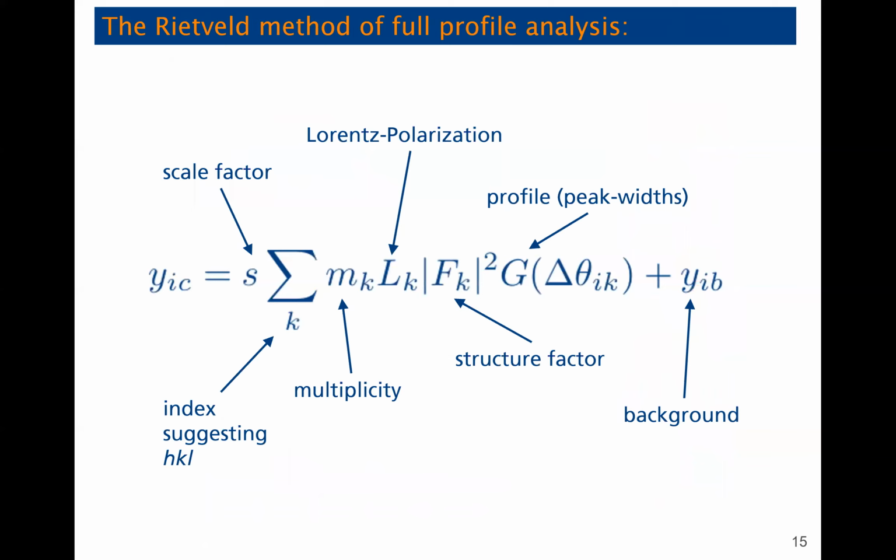I'm not going to go into this because it's a scary equation, but this is sort of what the software that I use is doing. This is the Rietveld equation, and it's describing y_c, the intensity that you would get at a certain angle. It's showing you all of the different things in the crystal structure or sample that would give you a different intensity at different points. And this is the equation that the software I use is fitting behind the scenes. So luckily, I don't have to actually do this math every day. We have scientific tools.